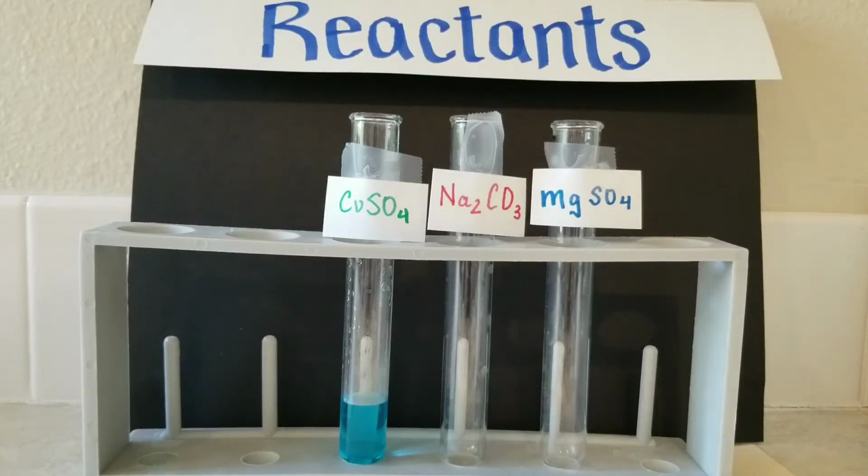For this activity, we're going to look at 3 different substances. Each has been dissolved into water. So the first one I've got there already is copper sulfate. The next one is sodium carbonate.